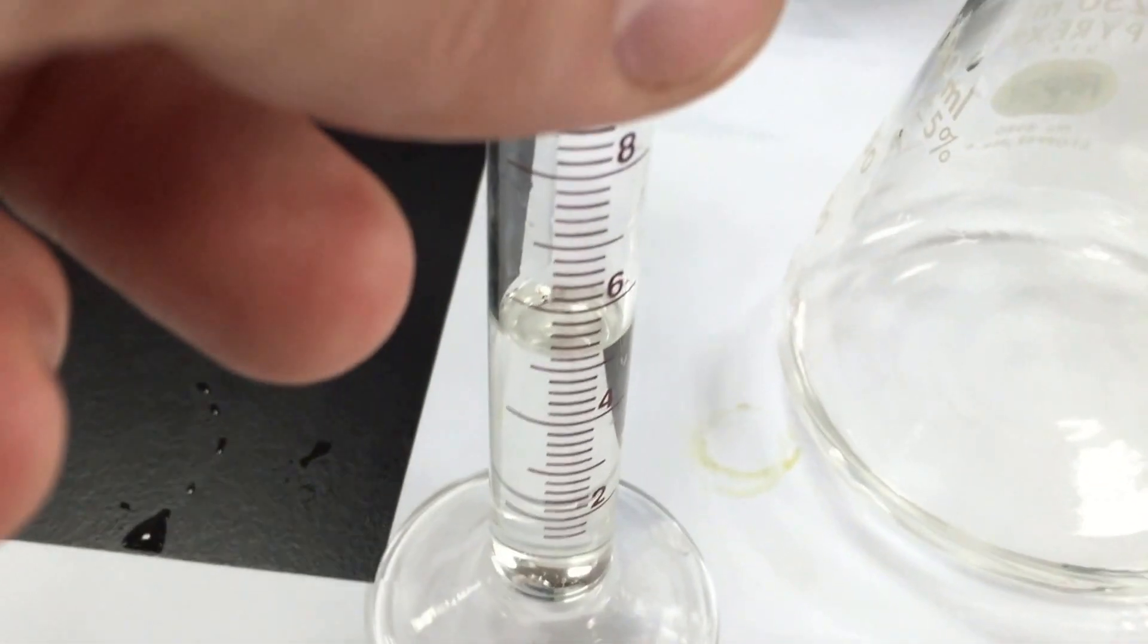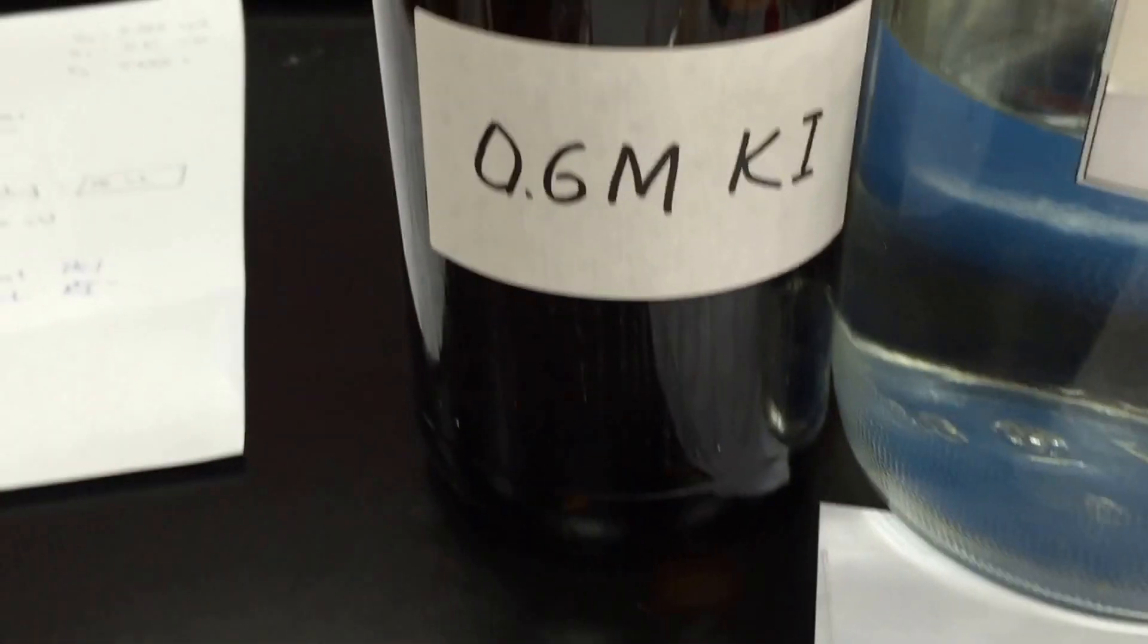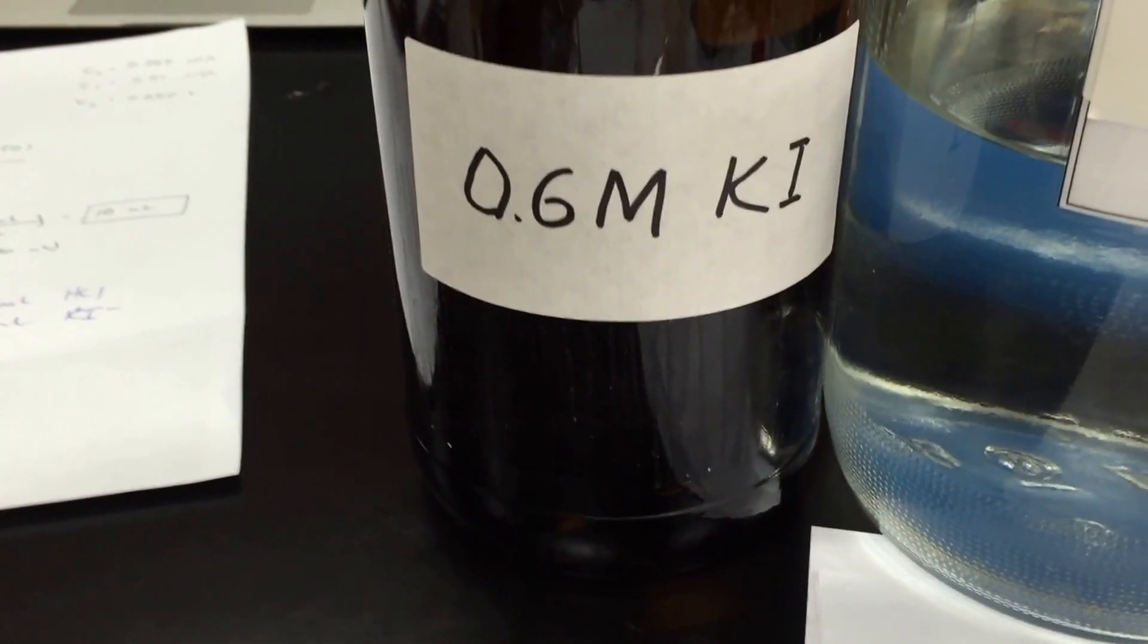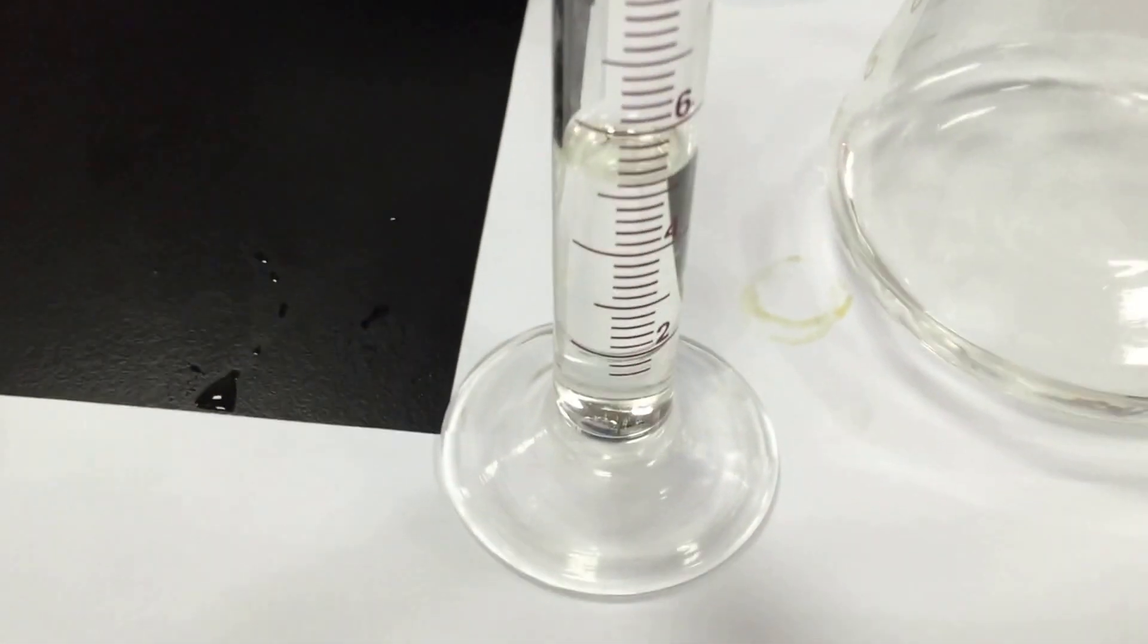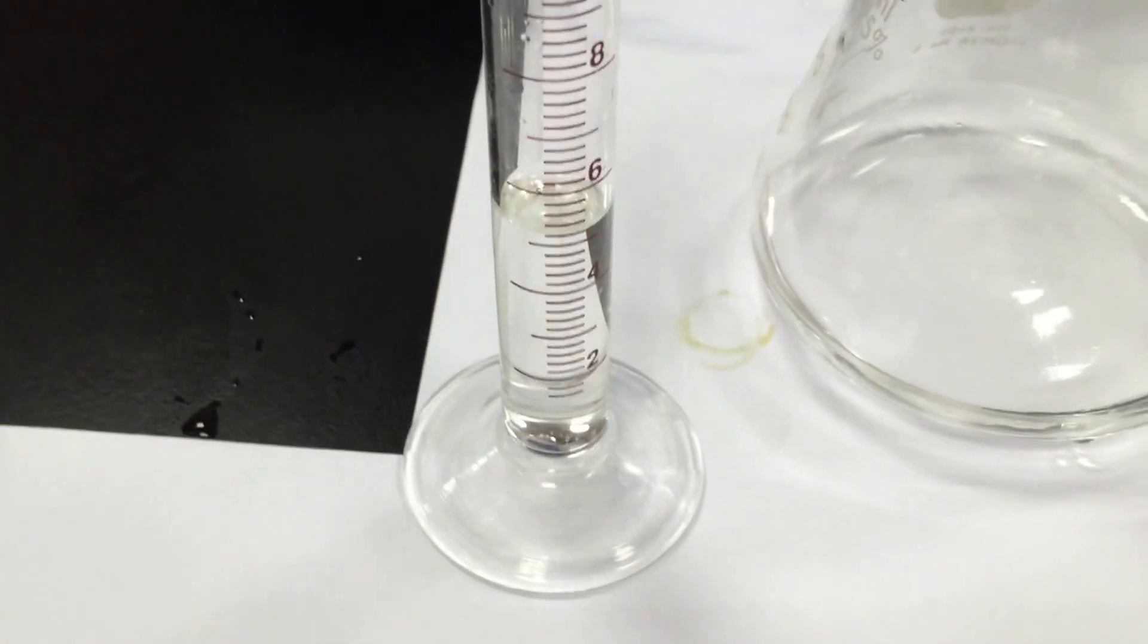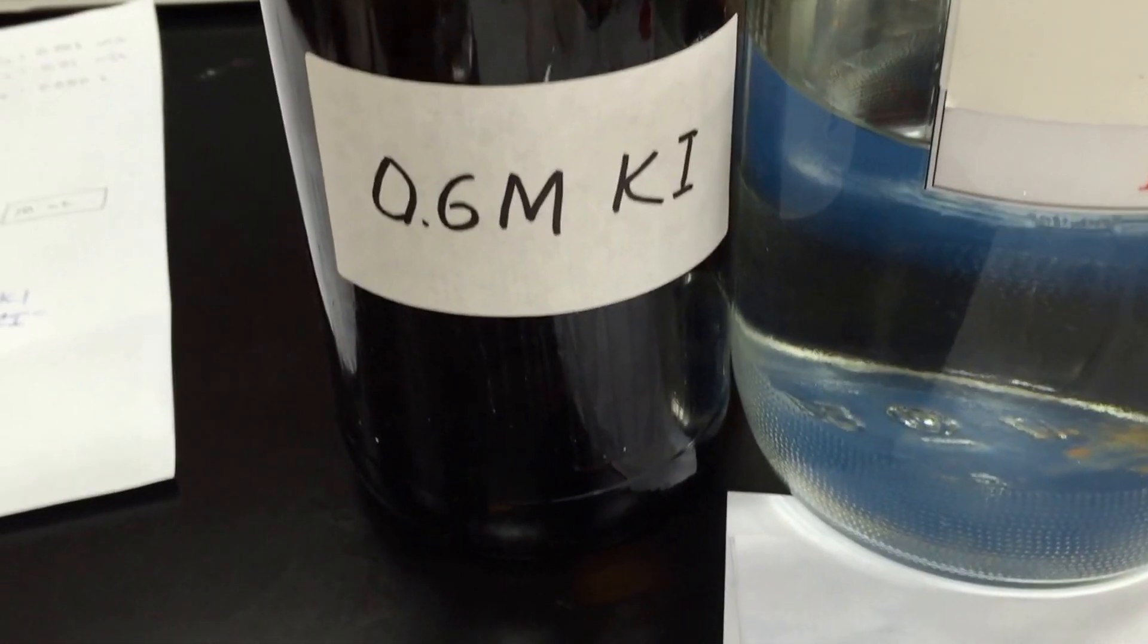So what we've got is five milliliters, approximately five milliliters, of potassium iodide. The iodide is going to cause the iodate to turn into iodine. That's a little confusing, but we're going from iodate into iodine using iodide.